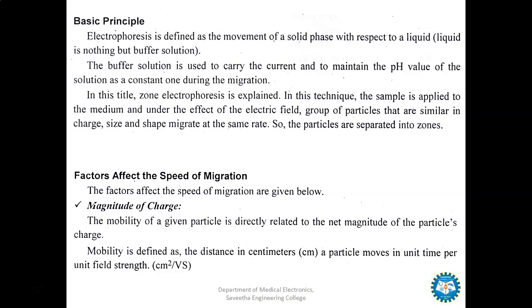Here, the sample is applied to a medium, and under the effect of an electric field, groups of particles that are similar in charge, size and shape migrate at the same rate. So the particles are separated into different zones based on charge, size and shape.